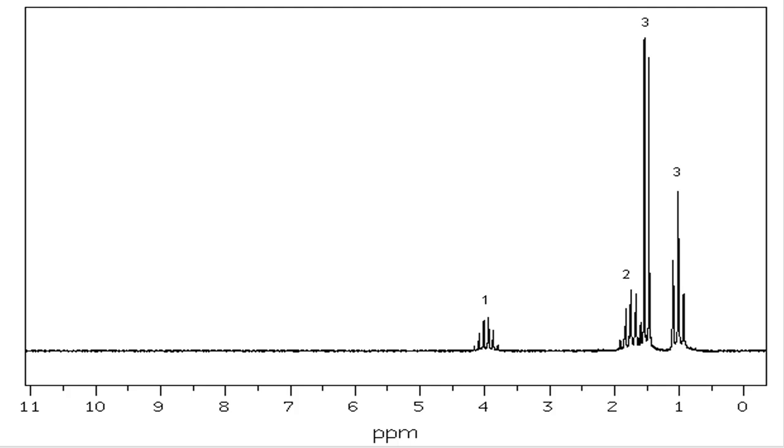Now let's apply that same rationale to this structure here. Note that this structure also has 4 signals in it, and when we think about our original 4 structures, there were only 2 that had 4 signals, so by process of elimination we can tell what this one is. But let's go through the exercise nonetheless. Pause the video here and see if you can construct the structure based on the information that's provided.